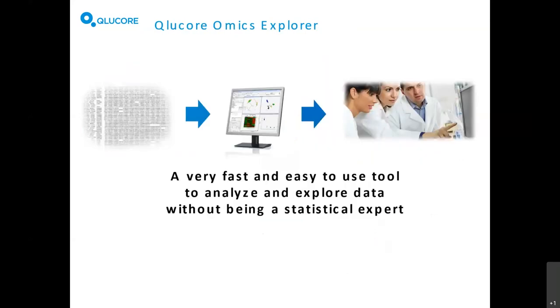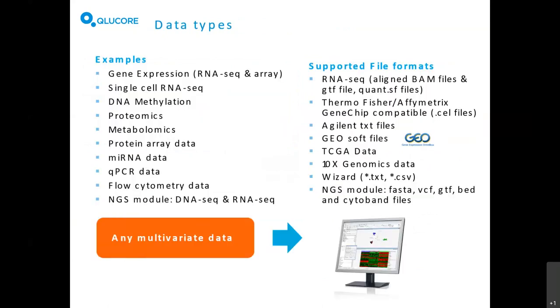The tool itself is a fast and easy to use tool to analyze and explore data. You don't have to be a statistical expert to do so. We can work with a number of different data types, and today I will focus on data that we get from public sources, mainly from SRA, though there are many different sources you can work with.